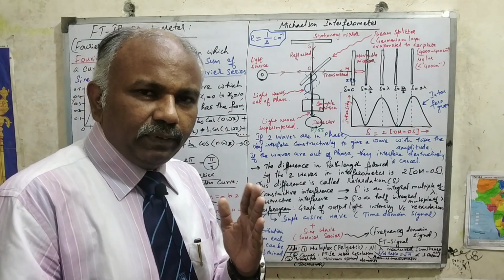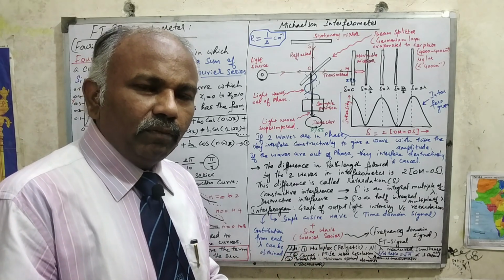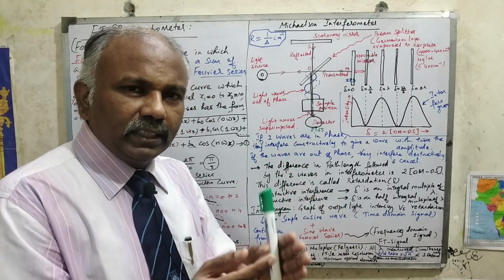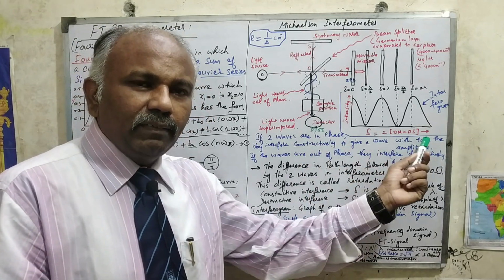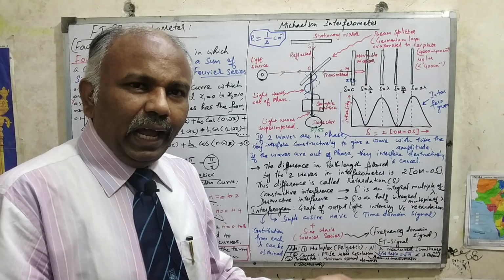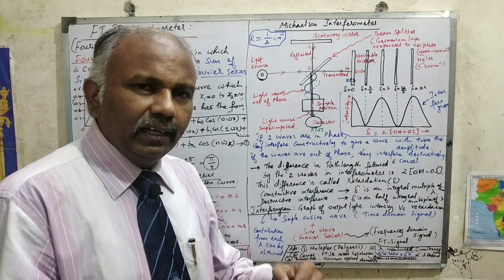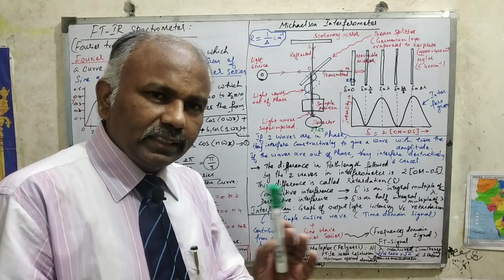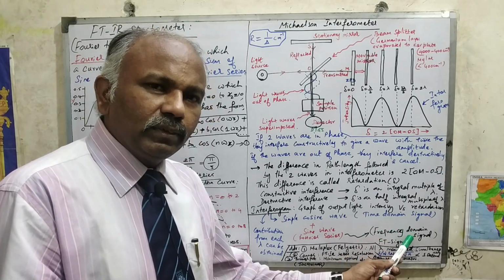But most of the modern FTIR spectrometers, we can record the spectra in a very fast manner. Why? Because they are going for Fourier transformation. So initially they will make the cos function only. Instead of making a full curve with both the sine and the cos function for every wavelength, which will take too much time, they will analyze all the wavelengths together and make only the cos function as an interferogram. And with that interferogram, if you add the Fourier series or any other mathematical series, automatically the sine function will be added, and that will lead to the formation of the full curve. When you construct a curve, you need both the sine function and the cos function, right? So that is called the FT signal, which is also called the frequency domain signal, right?